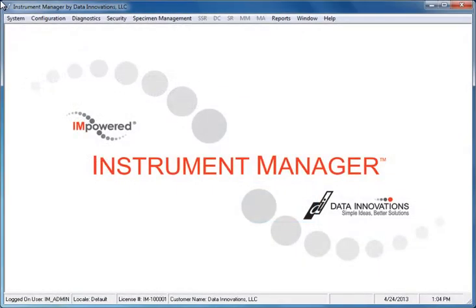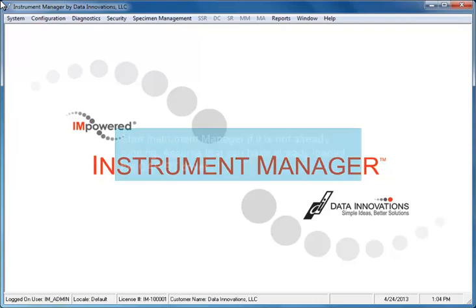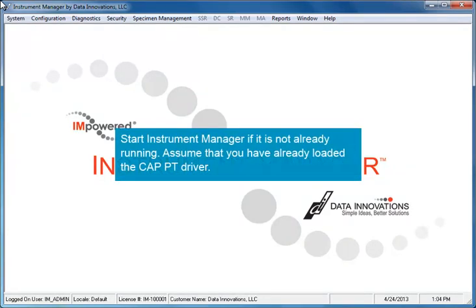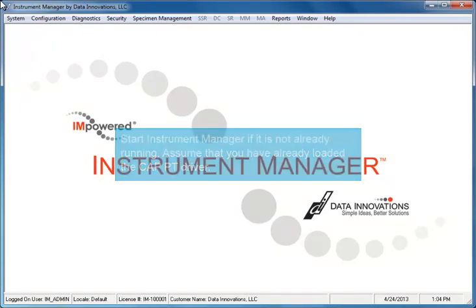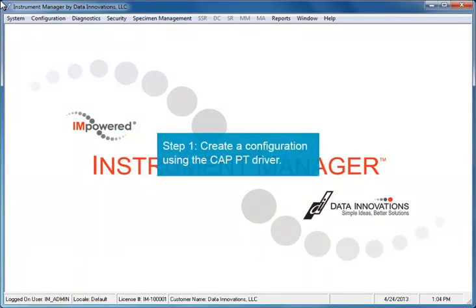Now you are ready to set up the DI Instrument Manager. Start your Instrument Manager if it is not already running. Assume that you have already loaded the CAP proficiency testing driver.